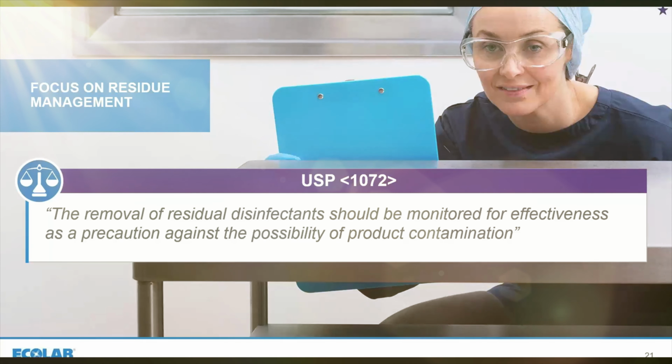I remember talking to someone who was at a company where a door of a freeze dryer had been disinfected and then closed, and some of the residues there had interacted with products. So these sort of interactions can occur at various places and at different levels, but there are also some other concerns about residues.